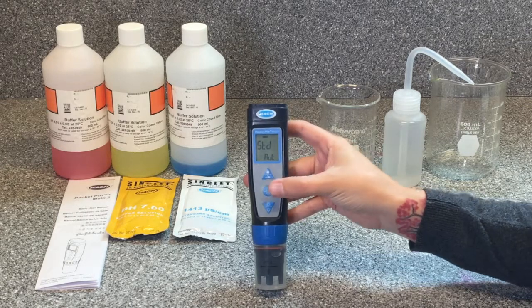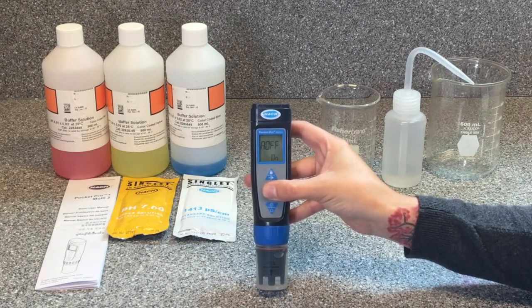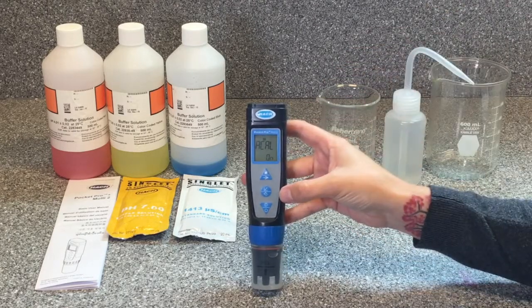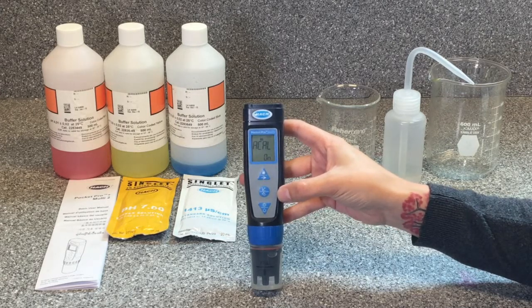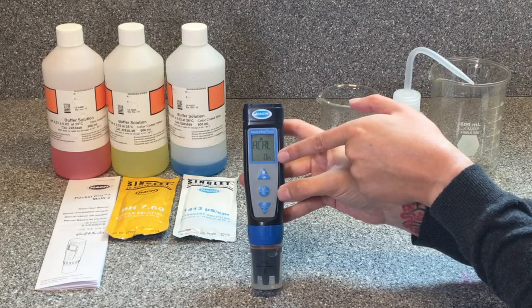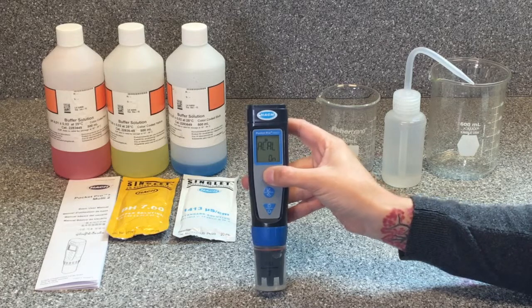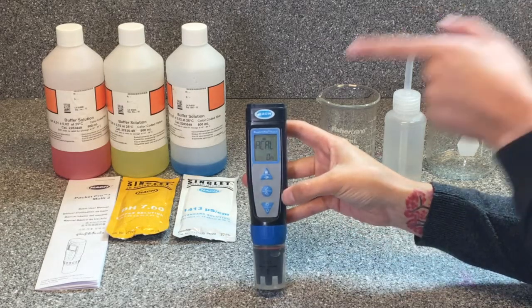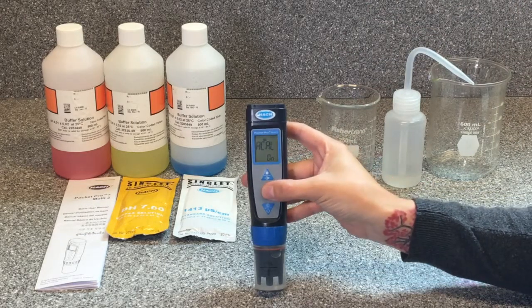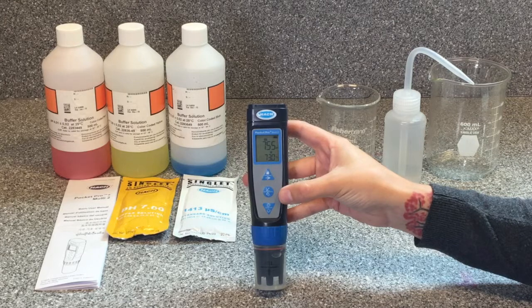Push the settings button until 'ACAL' reads on the screen — it should take six presses. Now it reads 'pH ACAL.' This setting allows us to set a reminder for when the pH needs to be recalibrated. It's not required, but we always recommend turning this on so that we're always remembering to recalibrate our pH for accurate results. Use the arrow button to select on or off. When we're done verifying settings, hold the settings button to exit the menu and return to normal operating mode.